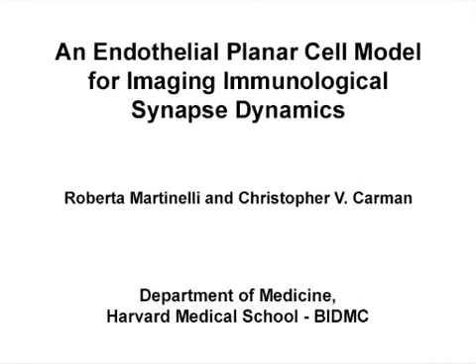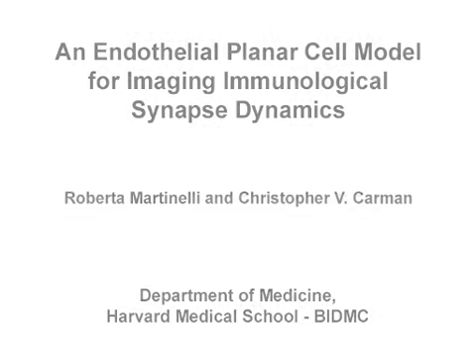The overall goal of this technique is to utilize endothelial cells as a novel type of planar antigen-presenting cell model to investigate fundamental antigenic signaling processes. This method can help us address key questions in the field of adaptive immunity, such as how subcellular and molecular remodeling dynamics are coordinated spatially and temporally within the immunological synapse.